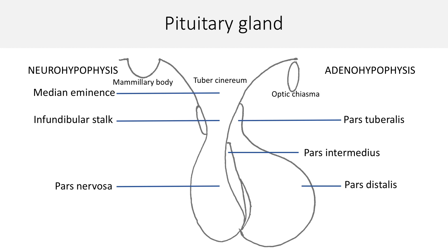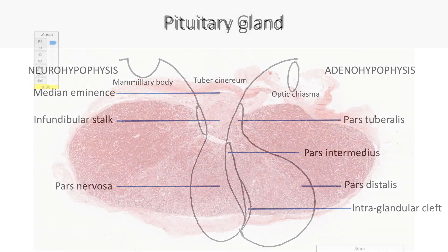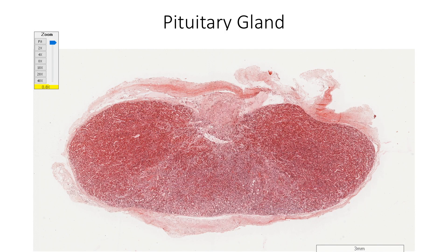Between the pars distalis and pars intermedius, the remnant of the cavity of Rathke's pouch can be seen as the hypophysial cleft or intraglandular cleft. Pituitary gland is covered by a capsule which blends with the surrounding meninges.